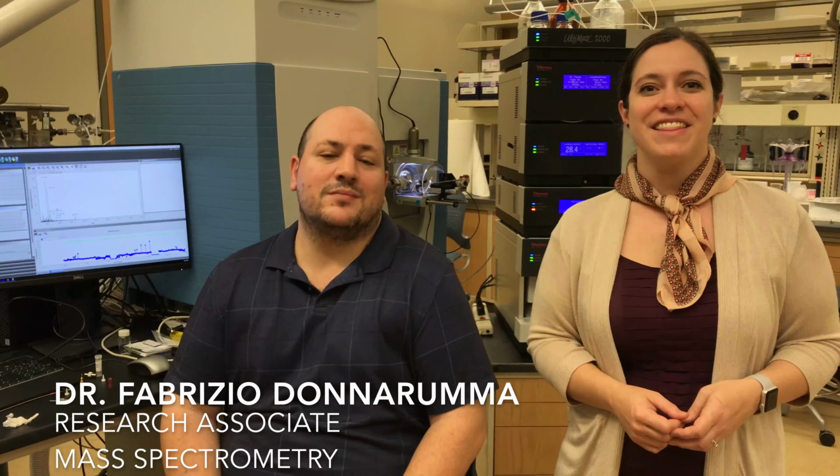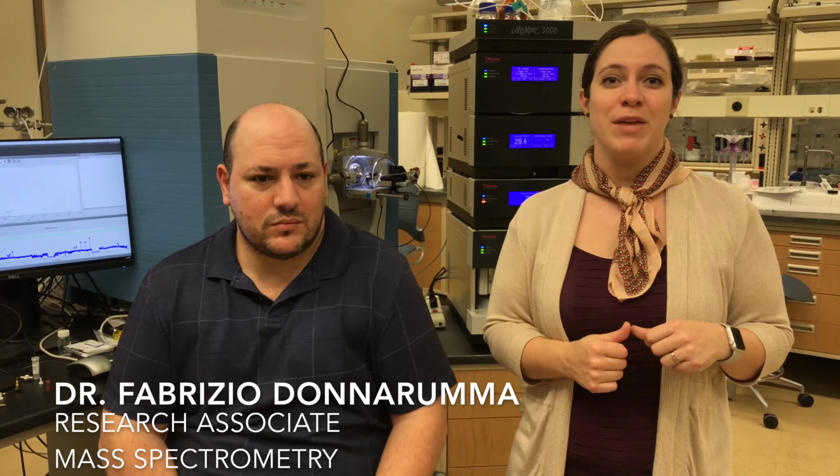Alright, hi guys. We are now in our other half of the main mass spec facility on the second floor. This is Dr. Fabrizio Donnarumma, and he will tell you about the mass spec standing right behind us.